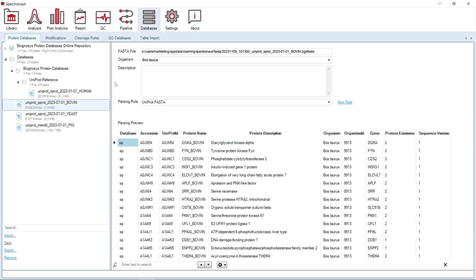The Database Perspective contains various resources used during analysis of your DA data or during SPECTRA library generation. For example, here you can find protein databases.